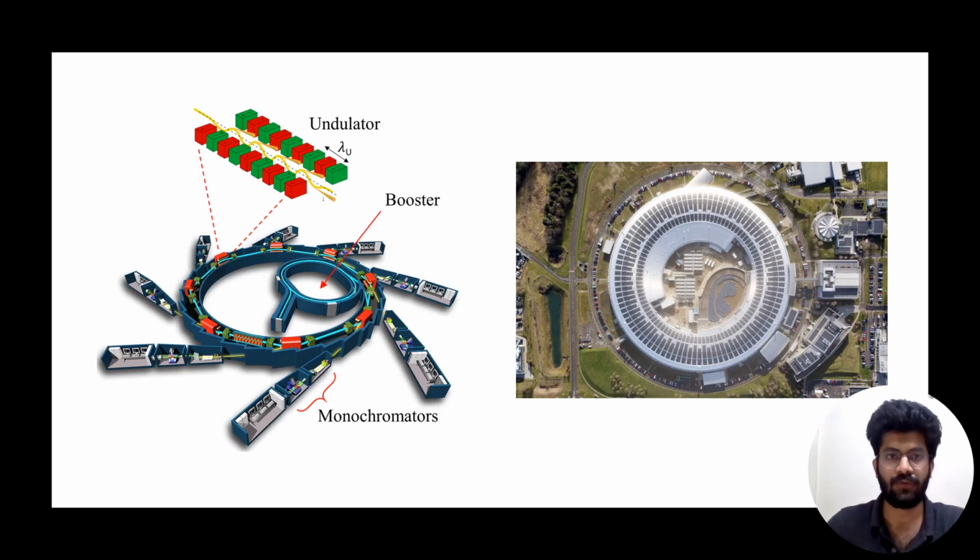The energies of these electrons in an X-ray tube are usually of the order of 10^4 or 10^5 eV, but we may require higher energy electrons to get higher energy X-rays to probe small crystals or when the crystal parameters are really small. For higher energy X-rays, we have synchrotron facilities. The one we are seeing is the Diamond Light Source in England.